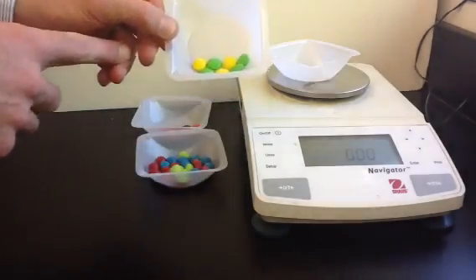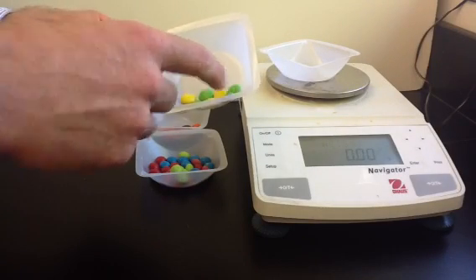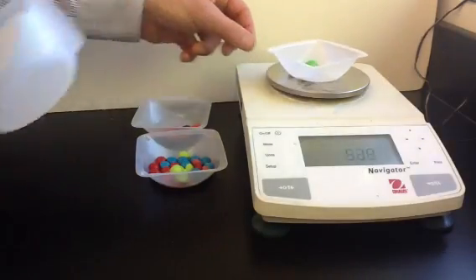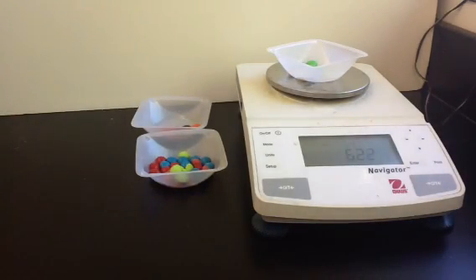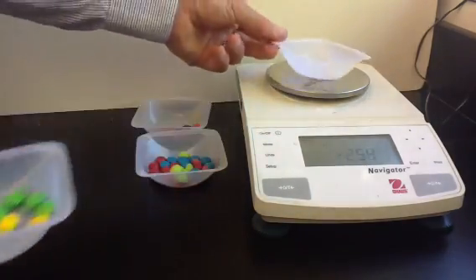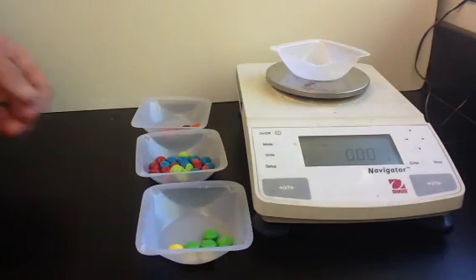So we'll start with the M&Ms. So the M&M isotope, we have 1, 2, 3, 4, 5, 6, 7 M&Ms in our sample here. And we'll put them on the balance. And our 7 M&Ms have a mass of 6.22 grams. 6.22 grams for our 7 M&Ms. So you can use that information to find the mass of a single M&M.